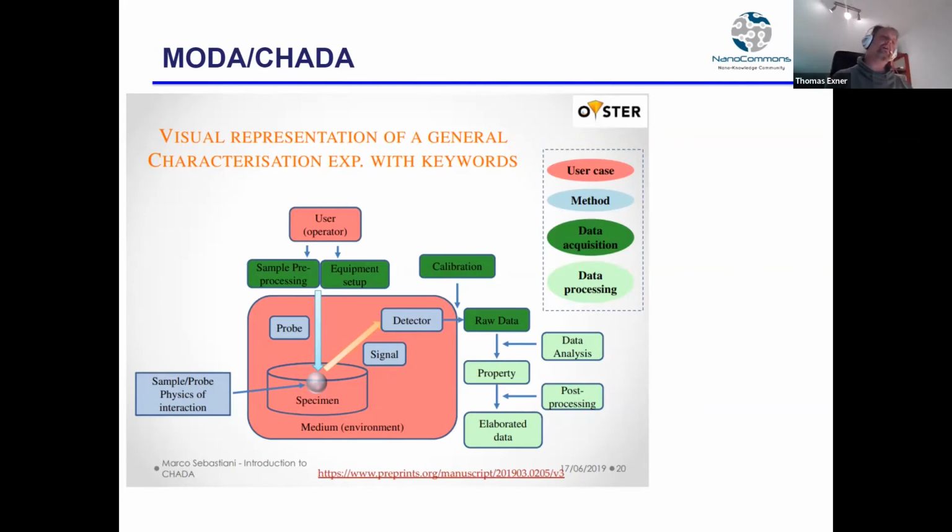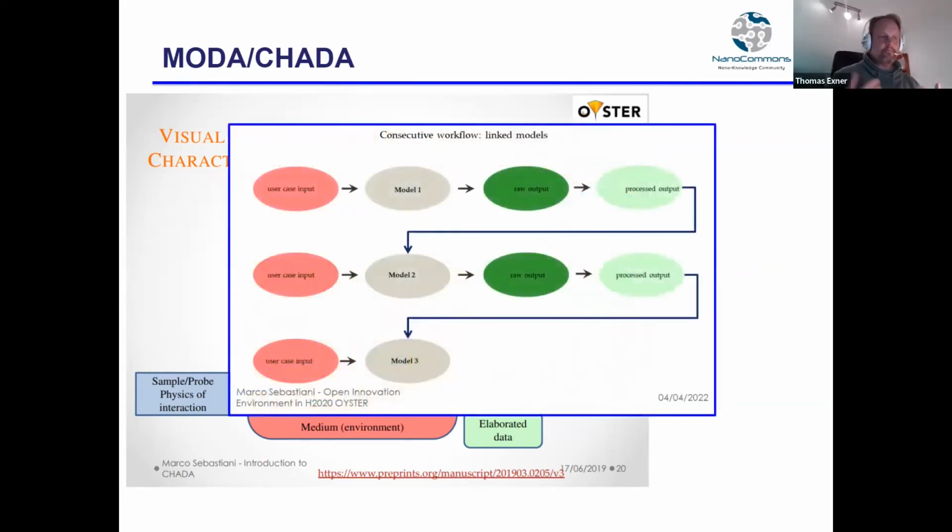And I think that is also something I would very much like to have for the experiment. If you already have that in the guidance document, the standard testing guidance or something like that, you can link to it. There is the information. Link to it, and then people don't have to check. They know what you were actually doing. Again, only to show that it's very similar. They have this combination of experiments where one is filling into the other. Again, I think this very much looks like an instance map.